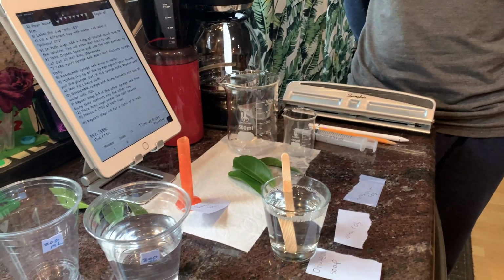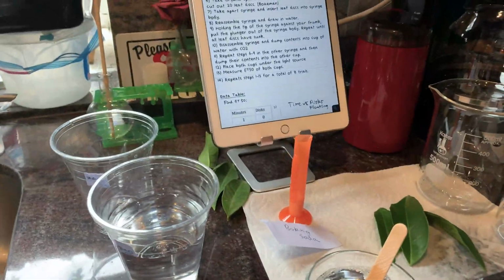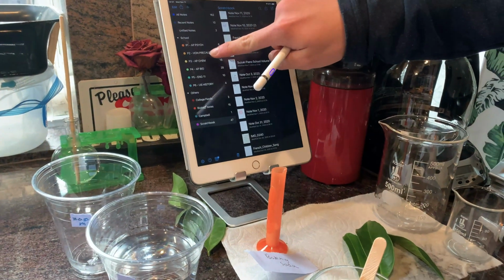as products. So in our lab, we were able to see when gases are formed. This is an indication of photosynthesis in action because oxygen gas is a product of the reaction. To do that, we'll first suck out all the gases from a fresh plant cell, and then we'll give it some carbon dioxide and light energy. And then we'll see that as it does photosynthesis, it produces oxygen gas and it will start to float in a cup.